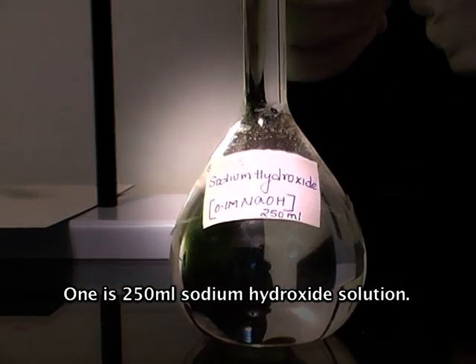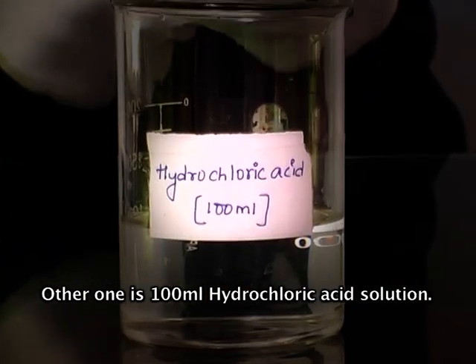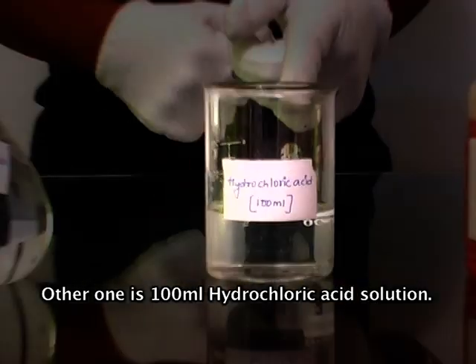Determination of the concentration by volume of a substance in a solution, as by titration. Here there are two types of solutions. One is 250 ml sodium hydroxide solution. The other one is 100 ml hydrochloric acid solution.